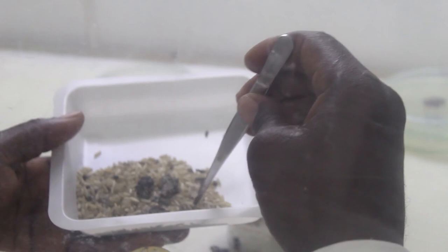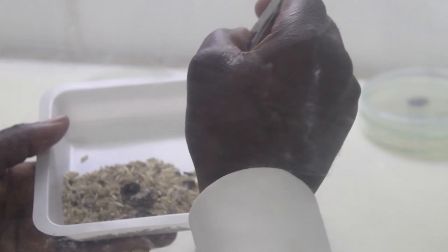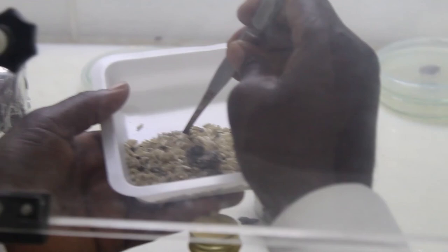Three grains of the colonized rice will then be used to inoculate each cowpea seed, and we will observe for disease formation.